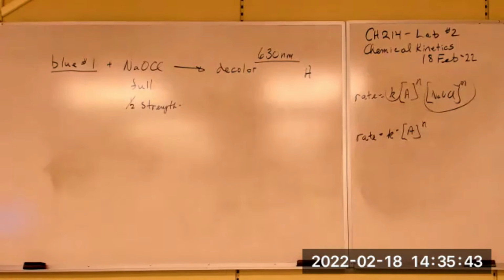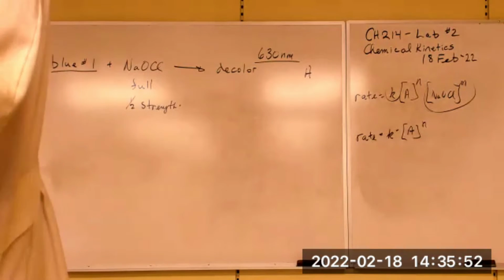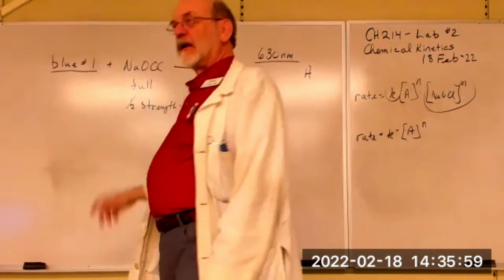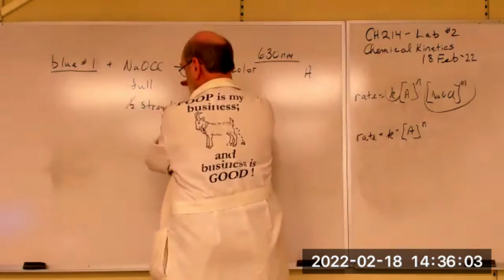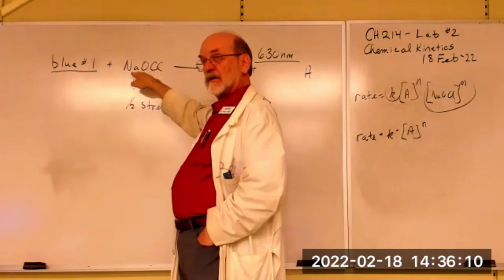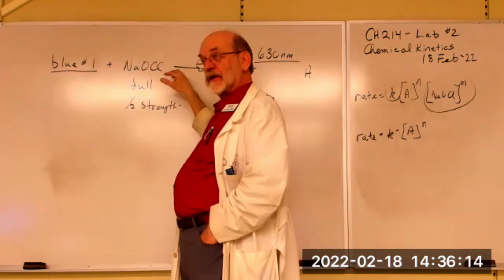Now it's complete. So the one that looks like a spreadsheet is where we calculate the actual concentration of bleach in the reaction mixture. And once you calculate it for full strength, you just take half of that for the half strength. Now, the one key to getting this transition right is this is a certain concentration of sodium and hypochlorite ions in solution.